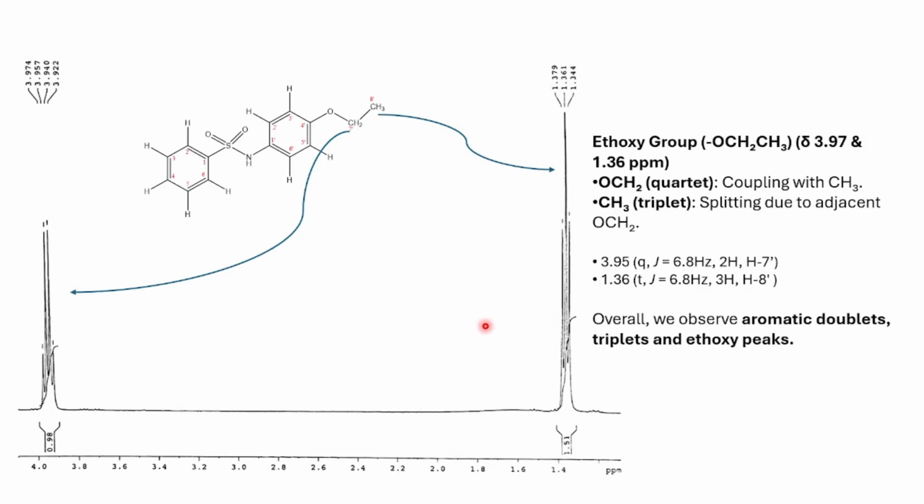Overall, we observe the aromatic doublets, triplets, and ethoxy peaks in this spectrum.